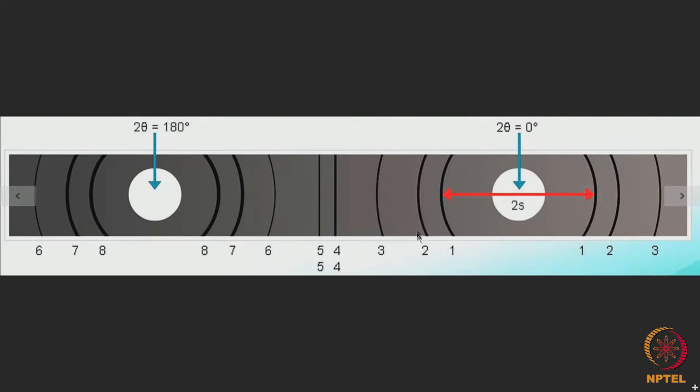Now, the first thing to do is to determine the distance between each of the line pairs which appear on the diffraction pattern. Say this is the line pair 1 1 coming from diffraction from a particular HKL plane, then these two are the 2 2 line pair which appear due to diffraction from another particular HKL plane.